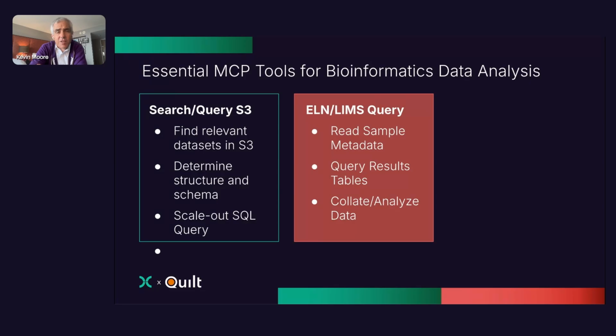A lot of that data, as Vasisht was mentioning, lives in other systems. The ELN and LIMS systems house a lot of that important metadata, particularly related to samples. So the ability to read sample metadata, to query things like results tables, and to collate and analyze data from your LIMS is really important to rounding out this analysis.